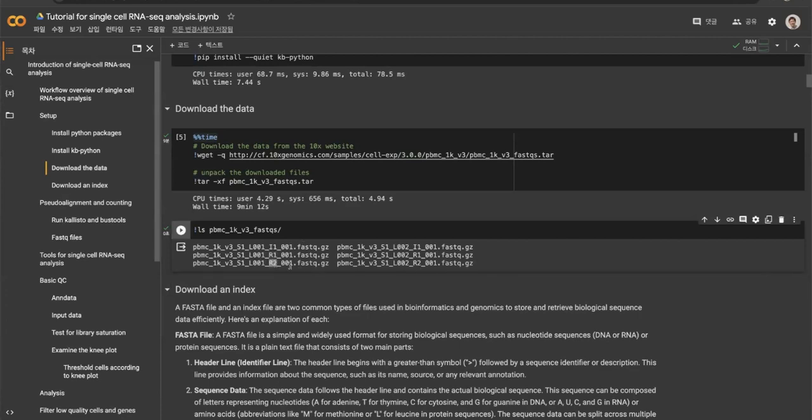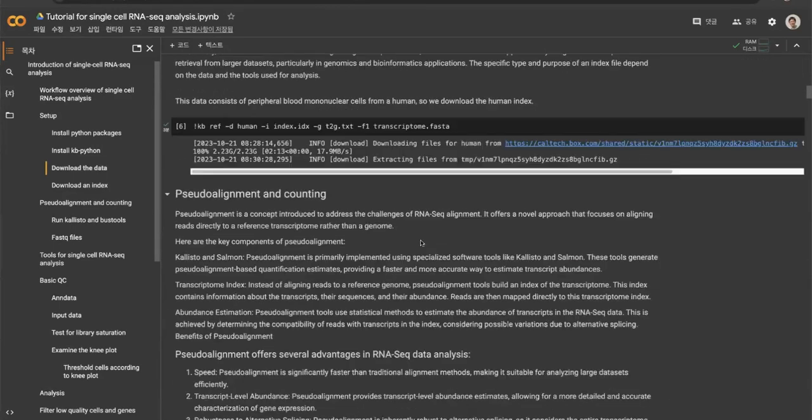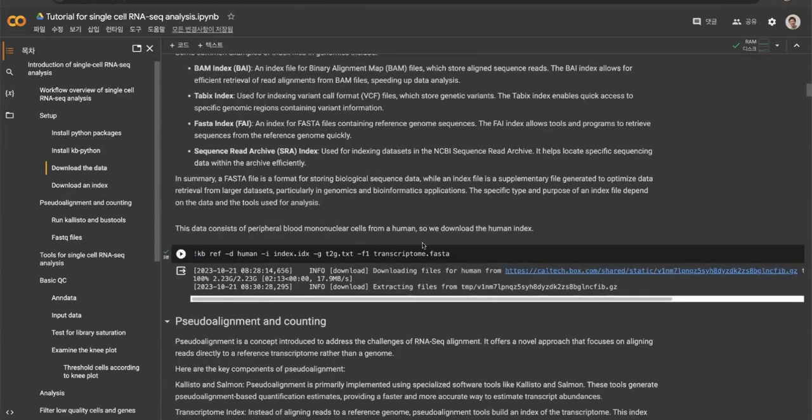So there is a meaning, right? I will explain later, but briefly, R1 is the first paired-end read, and this is the second paired-end read, right? That's why it's read 1 and this is read 2. And I1 is the index read, so it has the index barcode and the data. So this is one set of the dataset, and this is another set of the dataset. You basically get two sets of data. But we're going to go through the specific information about this FASTQ format.